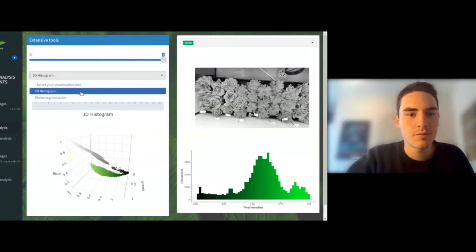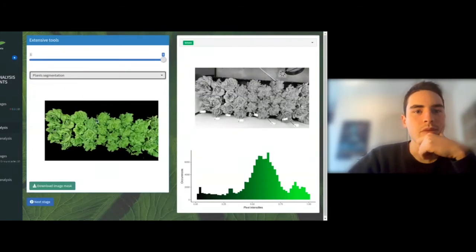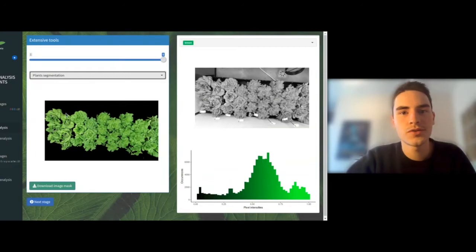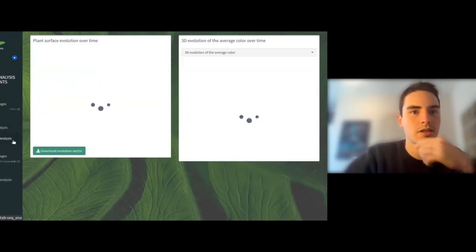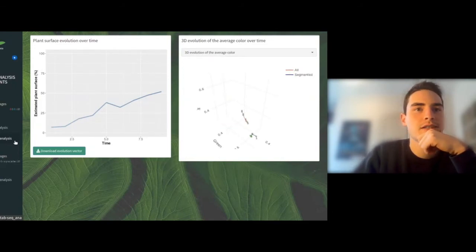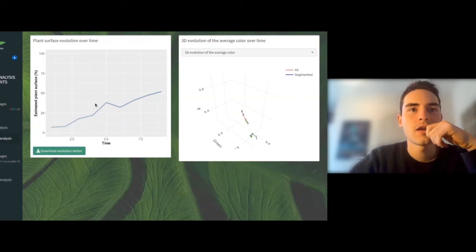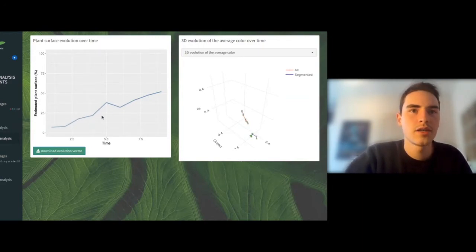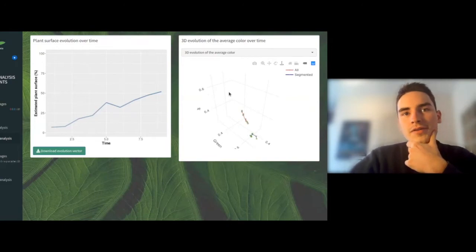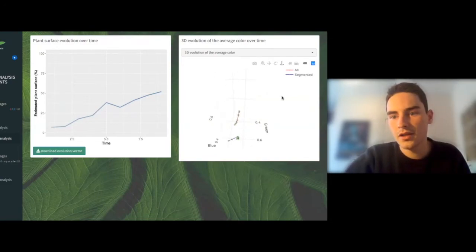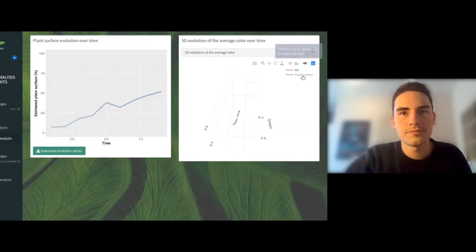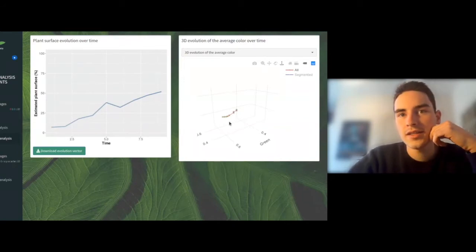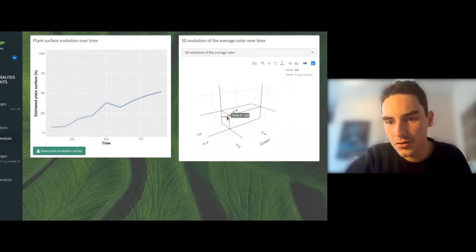We can now move to the plant segmentation. That calculation will allow us to go to the sequence analysis part. Once we have calculated the segmentation for each time, we can plot the plant's cover surface as a function of time. And at the right of the screen, we have the 3D evolution of the average color. If we include all the pixels like that, we can see that there is an evolution of the average color to the green.